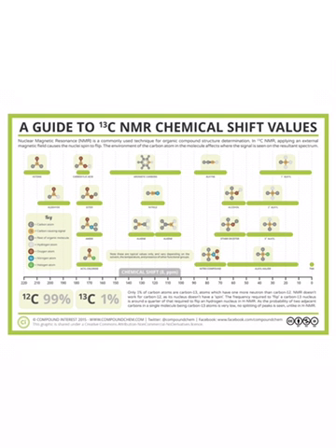So carbon-13 NMR is essentially the last step into verifying that the structure you have formed is the correct one for the chemical formula that you were initially given.